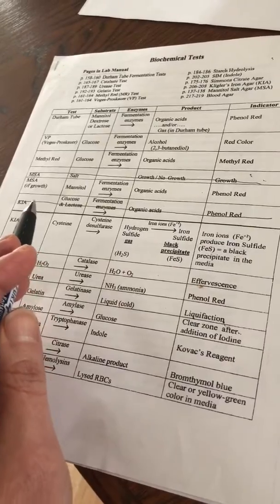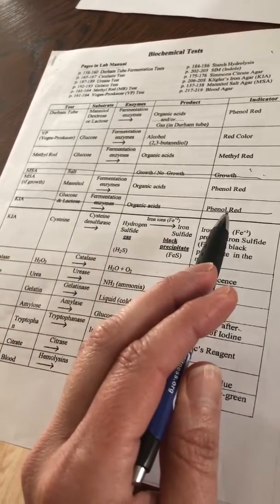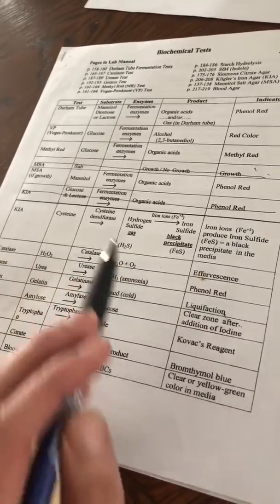And it's not something that we would have tested with your unknown anyway. So we're just going to cross that out and don't worry about that. You'll have to know this second line for KIA. But what we're going to go over now is this mannitol salt agar. So here are the test tubes for mannitol salt agar.